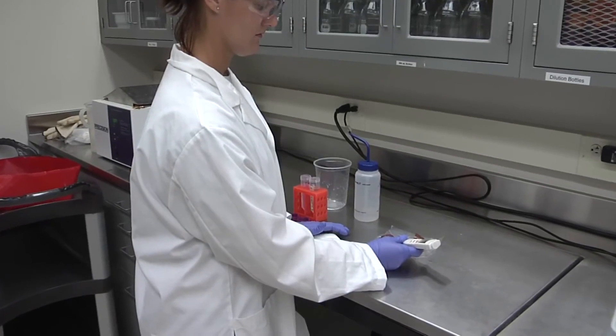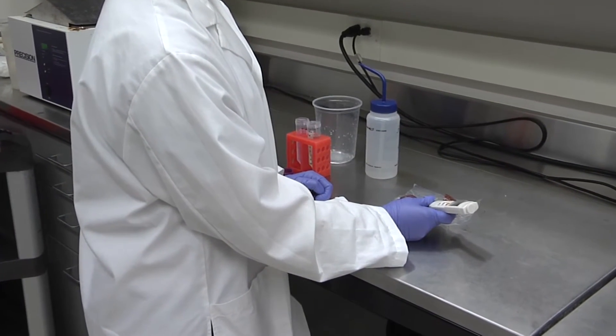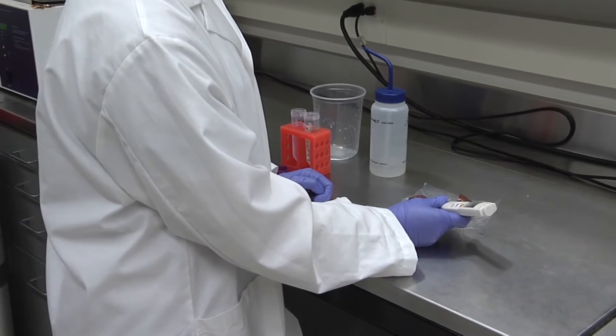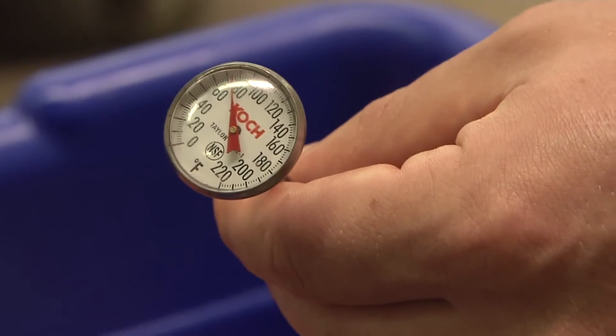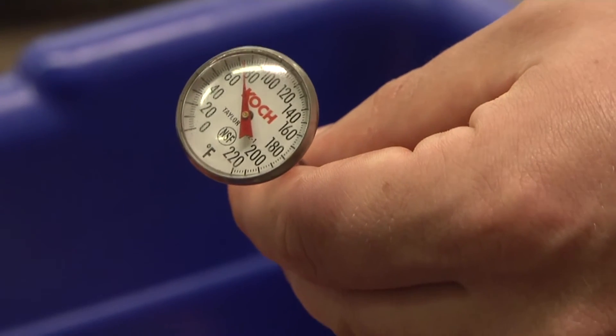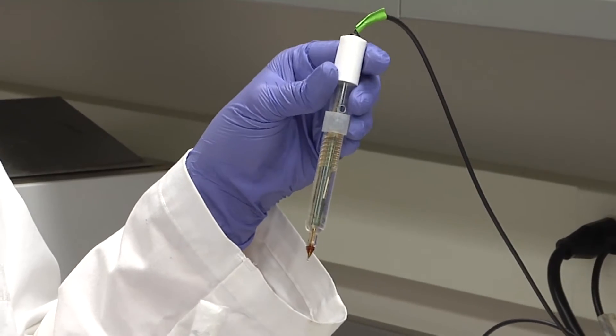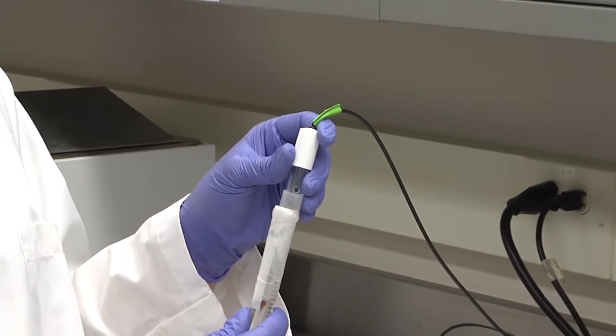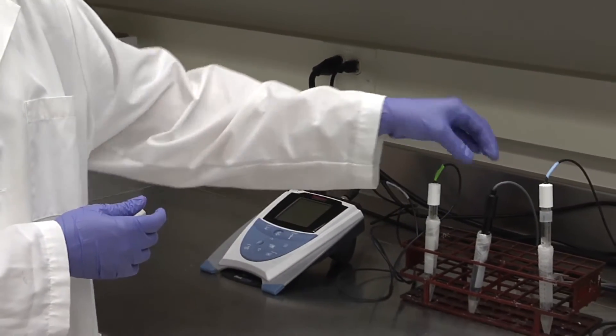Accuracy of measuring pH is often affected by traces and conditions that could be changed to increase the accuracy of the results. For example, temperature of the sample being measured or the electrode used to measure the pH. This segment will demonstrate and discuss choosing the appropriate pH meter and electrode for various products to be examined for pH.